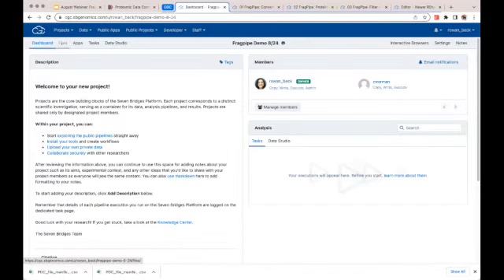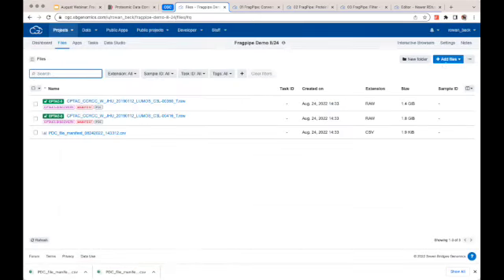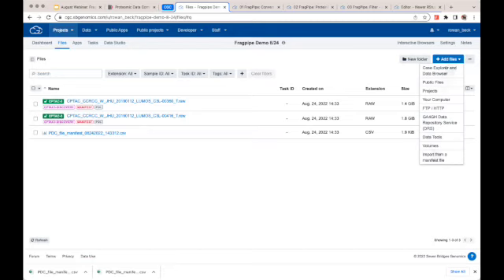Sure, you can just go to Files and then add files. There are lots of different ways to do it. You can browse our publicly hosted data. You can look for other public files. You can copy data over from a previous project that you had worked on. You can upload it directly from your computer, or from a computer like a high performance computing cluster. Importing from a manifest file is right here.